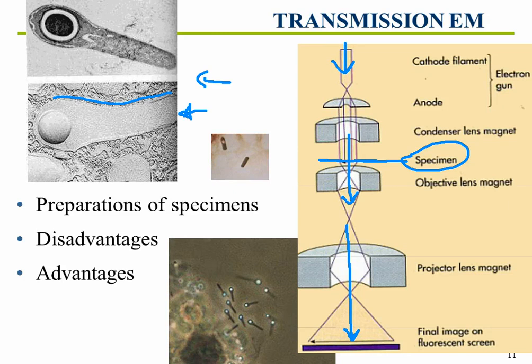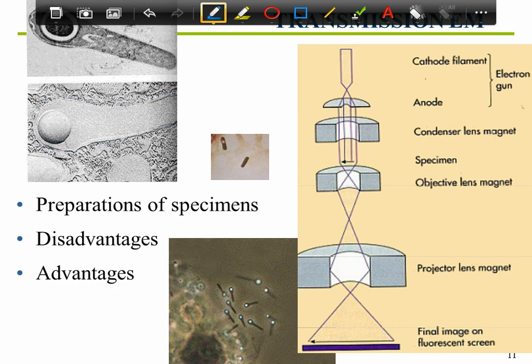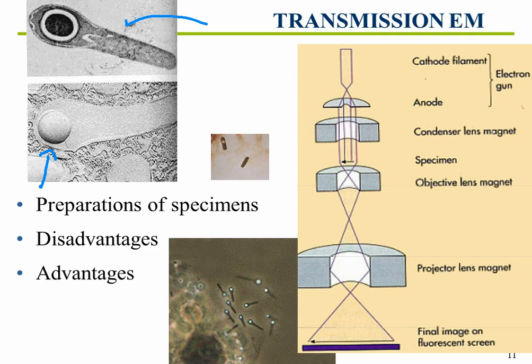There's your bacterial cell outline right there. This is an endospore, which we've already talked about. And notice right here it looks like there's a shadow on one side. This is done by shadowing. Now the picture up here has not been shadowed. It's also a spore inside of a cell, but it gives you a very different view.